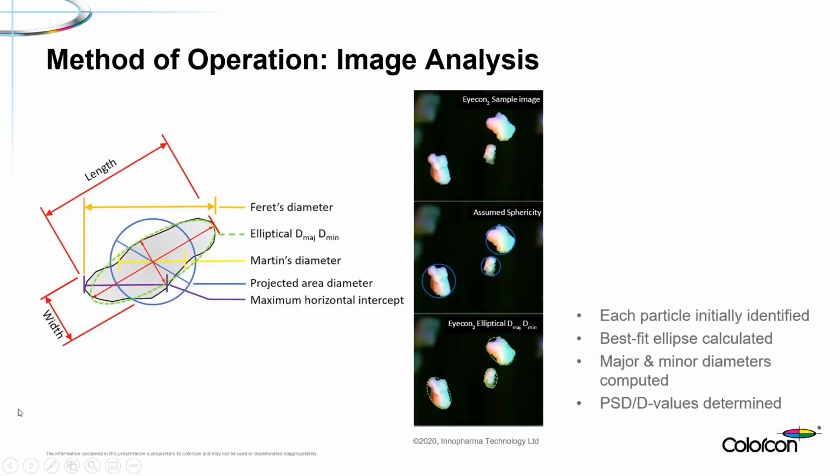That's image capture. Then once we've captured the images, how do we turn those into particle data? And I have to hold my hands up, my webcam's not on, but I have to hold my hands up at this point and say these image analysis algorithms have been written by people with a lot more understanding than me. So you're going to get the executive summary, partly because that's all we have time for, and partly because that's all I really understand anyway.